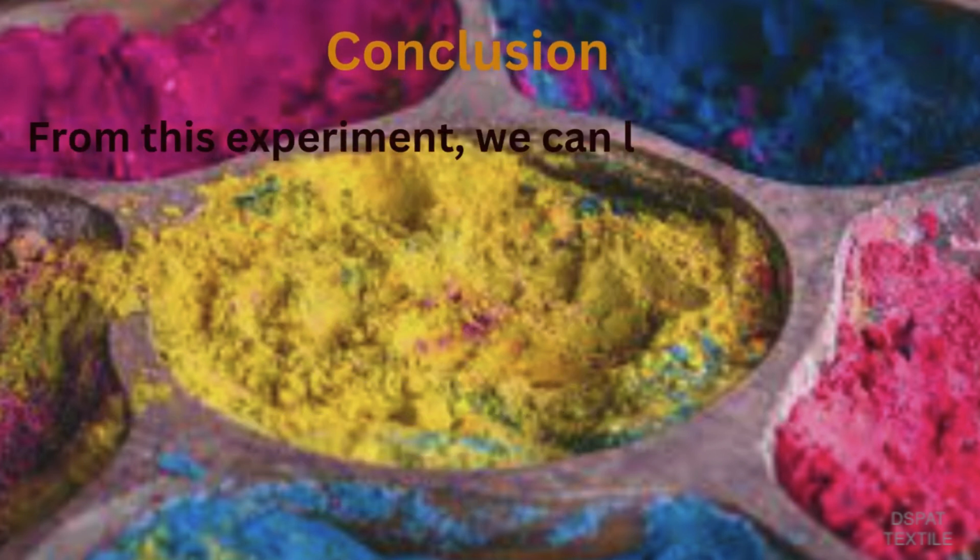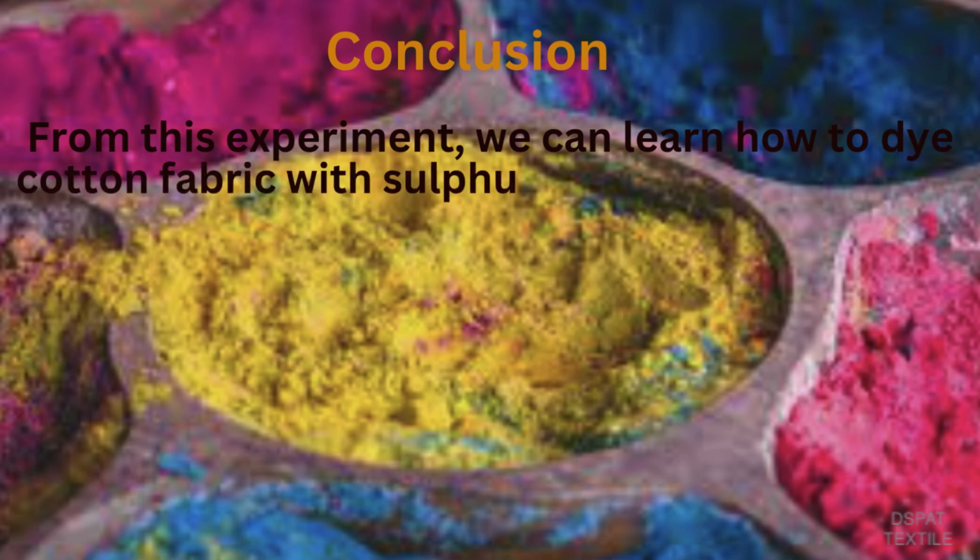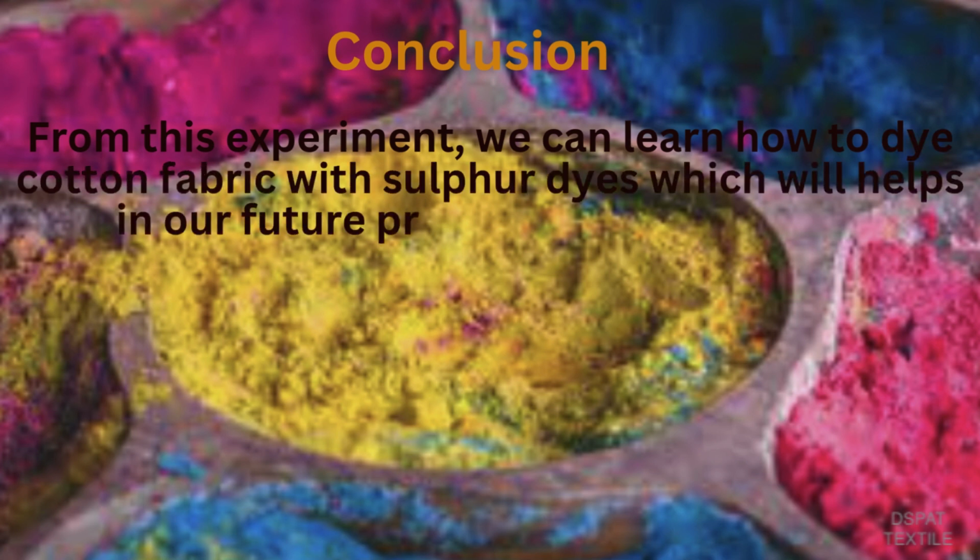Conclusion. From this experiment, we can learn how to dye cotton fabric with sulfur dyes, which will help us in our future practical dyeing job life.